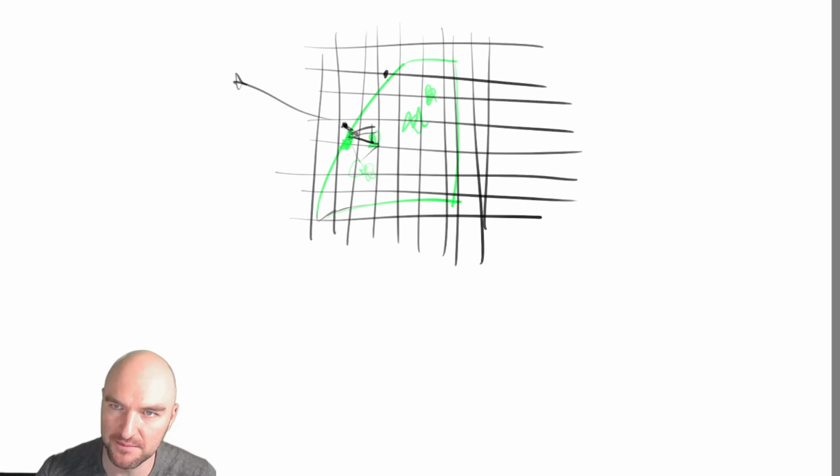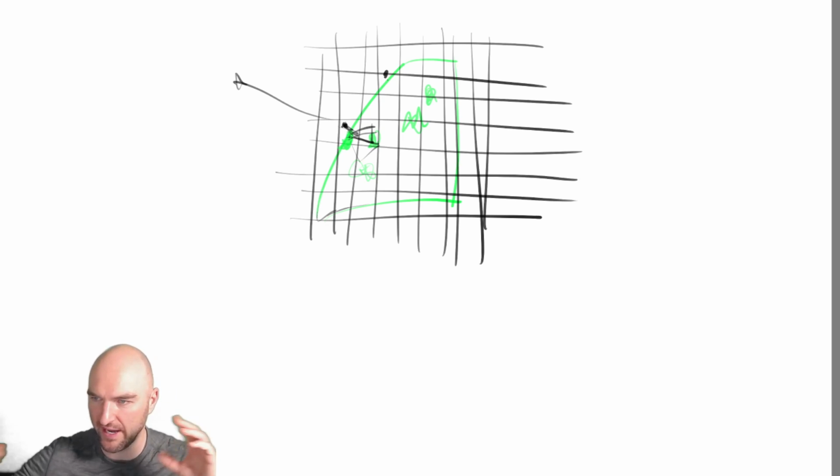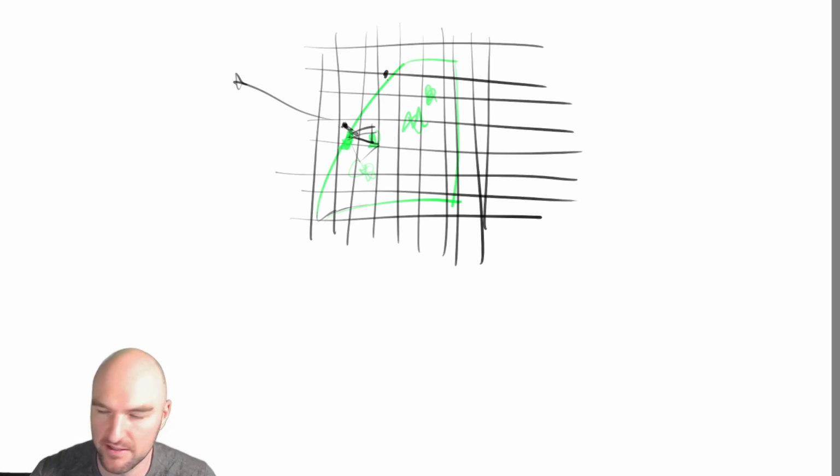But still, they are there. Of course, what you can do is have the dataset hull clip the isosurface, so they remove any isosurface vertices that are outside the hull. This is actually possible, but we haven't done that right now. And then same story as before.